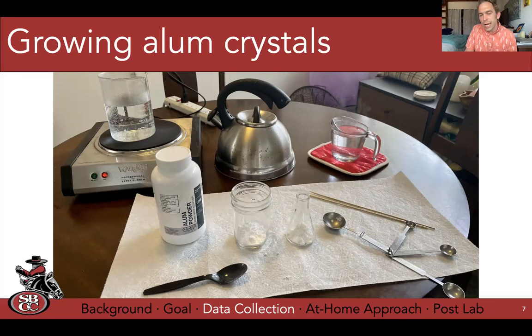You're asked to use a tablespoon. You really don't need a measuring spoon. I have them pictured here, but you really don't need it. And the reason is that you're going to bring your solutions to the solubility point. And that's the most important thing, to get it right to the point in which it's in solution at a really high temperature, knowing that as it cools down, our alum is going to be forced out of solution. And so more importantly than getting the measurements right, you've got to get a feel for what that looks like and know exactly when to stop adding hot water.